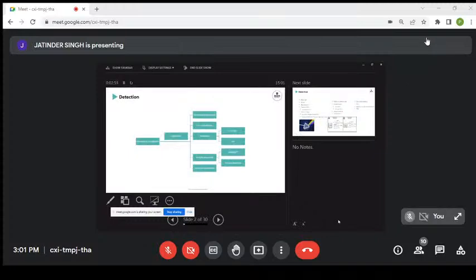And the application that you're using the device for is very important in deciding what kind of detection approach you want to take. There are practical considerations there with your assay. Like, do you want a quantitative or a qualitative answer? Quantitative means that you want to know how much is in there. Qualitative means that you just want to know if it's there or not.